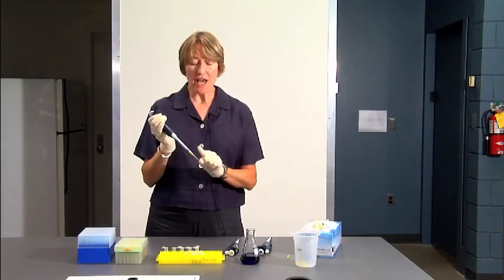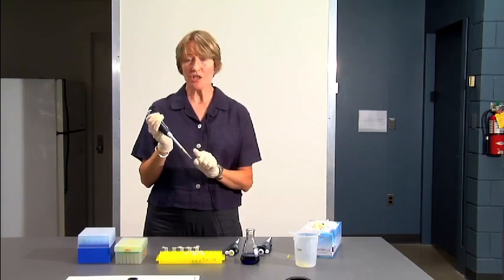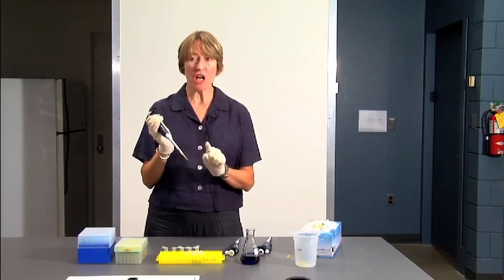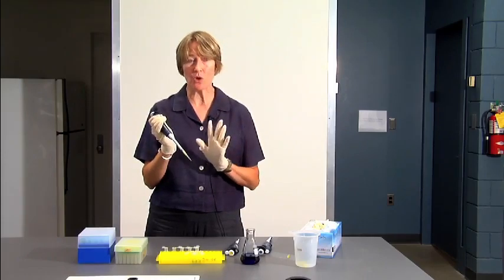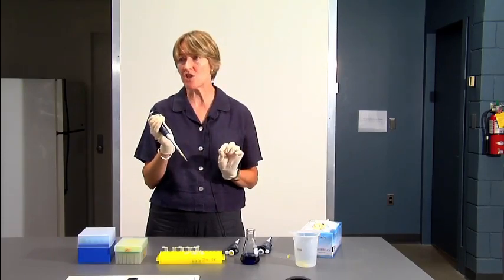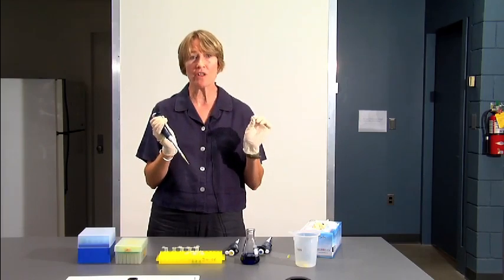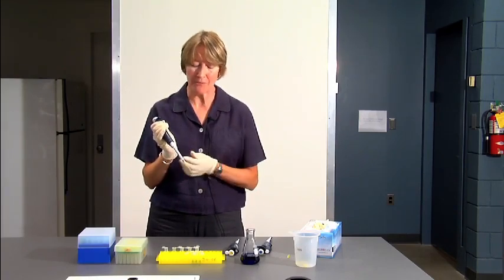One other thing to remember is you never want to touch the tip of your pipette to the table, or touch it with your gloved hands, or touch it to anything else except the reagents that you're using, because again, you don't want to contaminate the environment, and you don't want the environment to contaminate your sample.